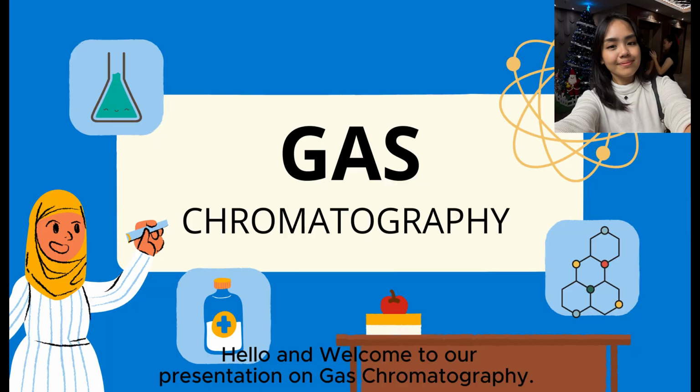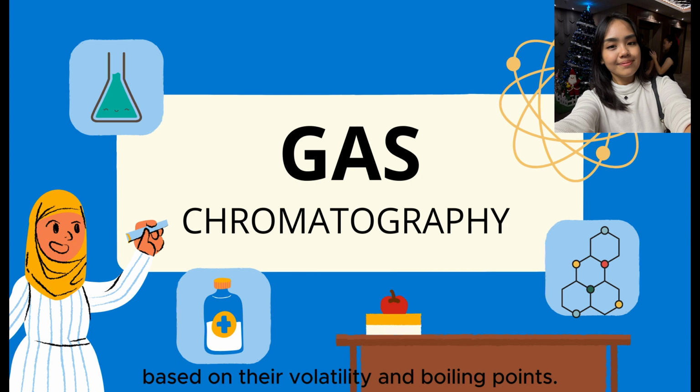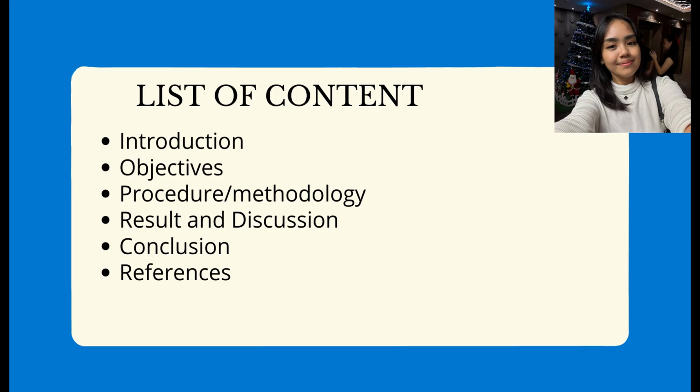Welcome to a presentation on gas chromatography. Today we are exploring this essential analytical technique used to separate chemical mixtures based on their volatility and boiling points. This is our list of contents, which is organized into several key sections to help you follow our study.